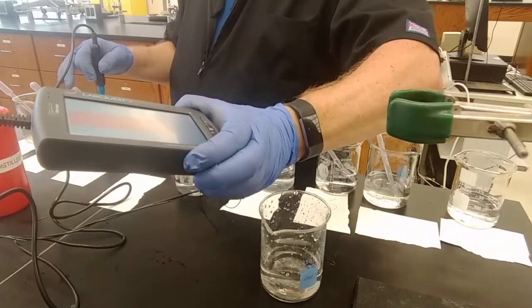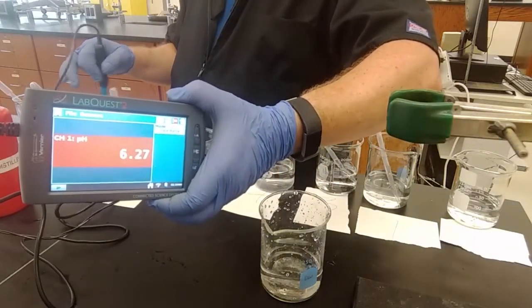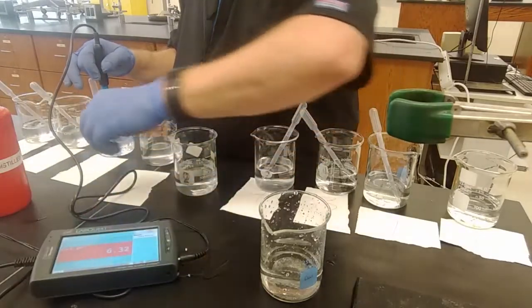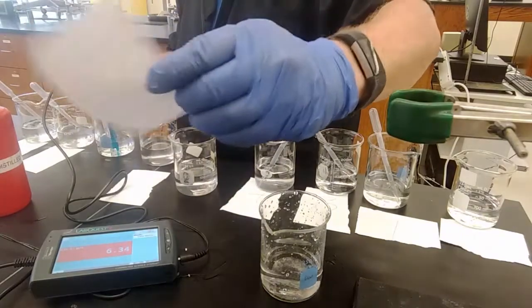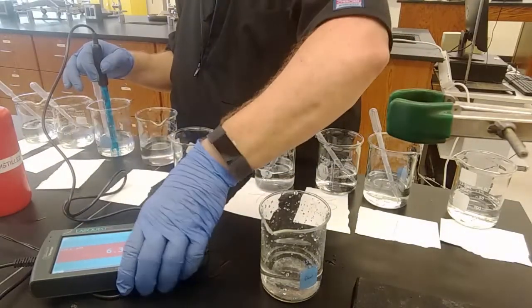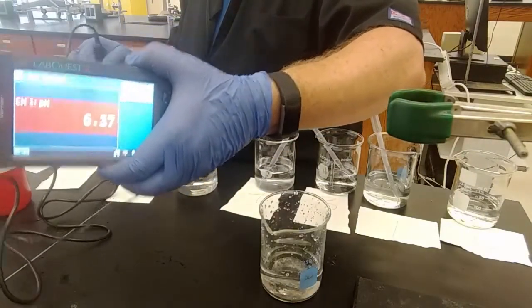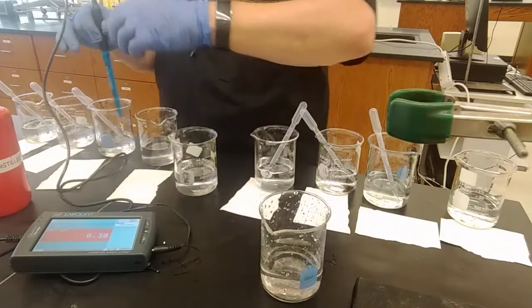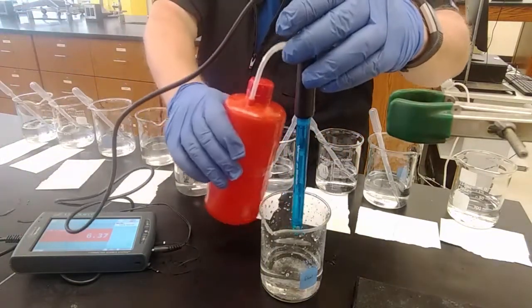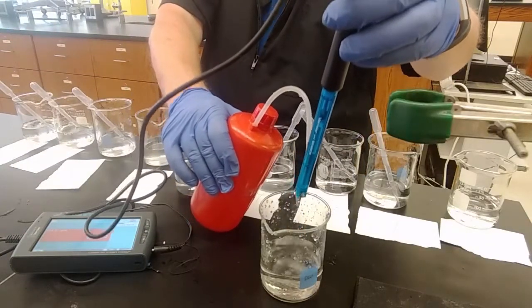5, no, we're up to 6. 6.27. We're expecting 11 based on our dilution, but we diluted with not deionized water. So we're at 6.38, let's call it. At some point, we're going to have so much base, maybe at 13 and 14, that it's going to overwhelm the deionized water. But we'll see.